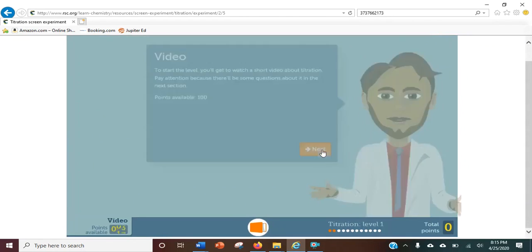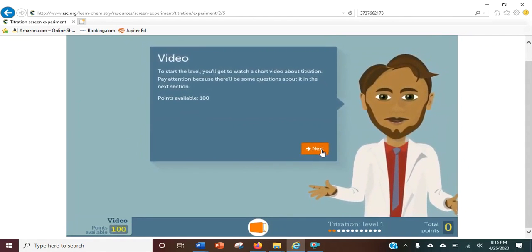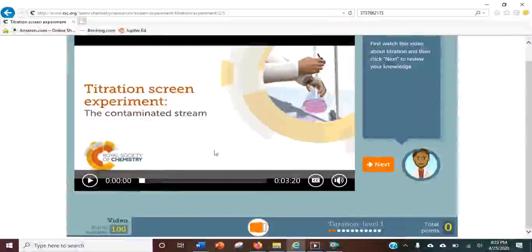So click next. So the first is a video about titration, in which there's 100 points available. Okay, so now watch the video by clicking play.